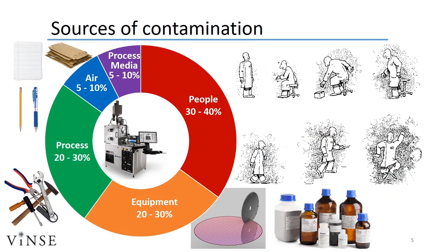The main source of contamination is by far the people in the space. The more active a user, the more debris they generate. For both cleanliness and safety concerns, users should work carefully and mindfully in the space. Running is not permitted in the clean room. Other sources of contamination come from the tools, media, and processes used in the clean room. For instance, just like a wood saw, the wafer-dicing saw will generate dust as it cuts through substrates. As such, it is kept in the chase to promote clean process bays.